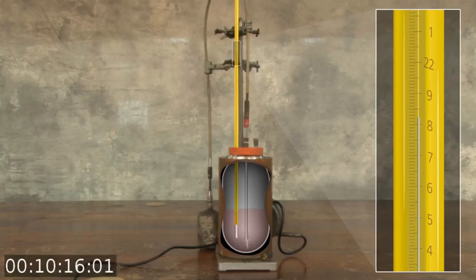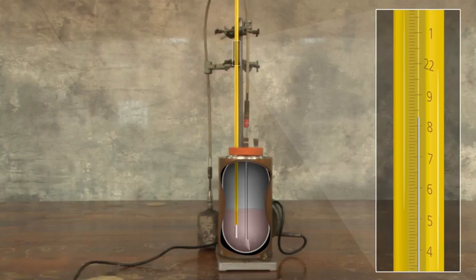Now consult the experimental sheet, which should guide you step by step through the calculations you need to perform to calculate values for the enthalpy of decomposition of liquid hydrogen peroxide and the HO-OH bond dissociation energy of hydrogen peroxide. You will be assessed on the two values calculated. Good luck.